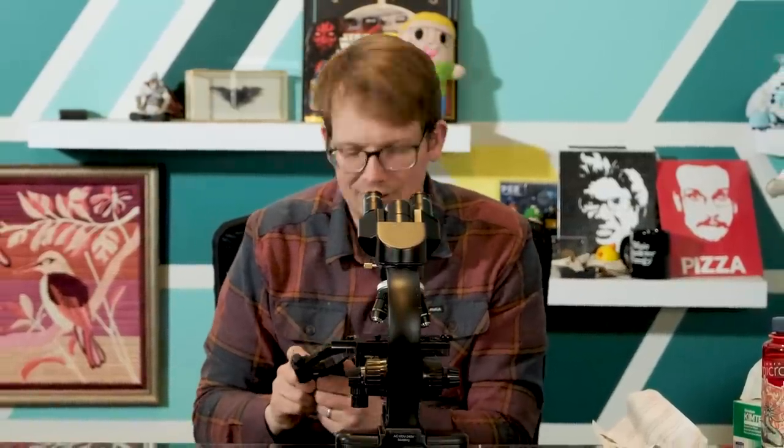This is our phone mount — that will come with a separate little instruction manual, and there are also instructions in the guide. As you put your eyes on a microscope you'll see there's a pretty small point of light as you approach it. It's easier with your own head to get your eyes into the exact same space, because you've been moving your head around your whole life. It takes some time after you clamp the phone mount on to get the right lens of your camera focused on the right point of light. It's a little fiddly, but you fiddle around and then you're able to do it. I actually find it can be more comfortable to use the phone mount for long periods because I'm just looking at the screen rather than hunching into the microscope.